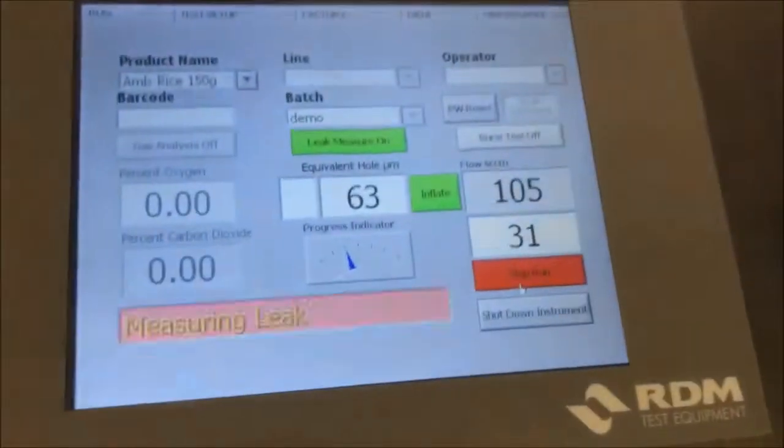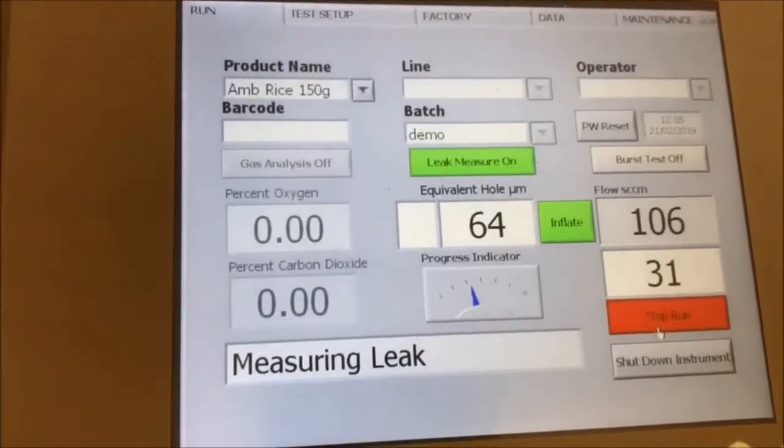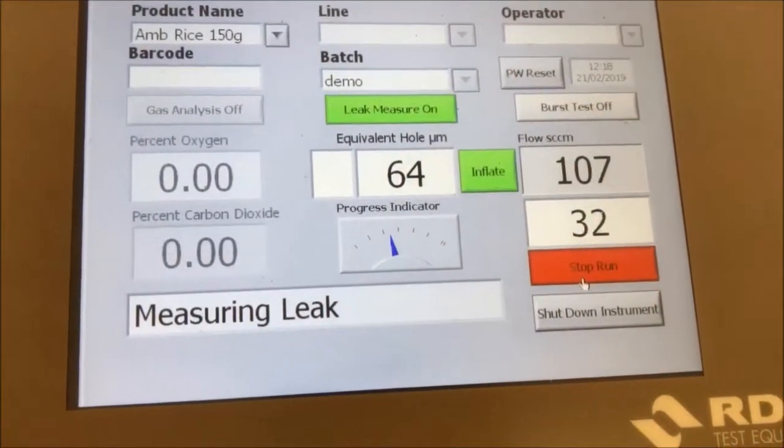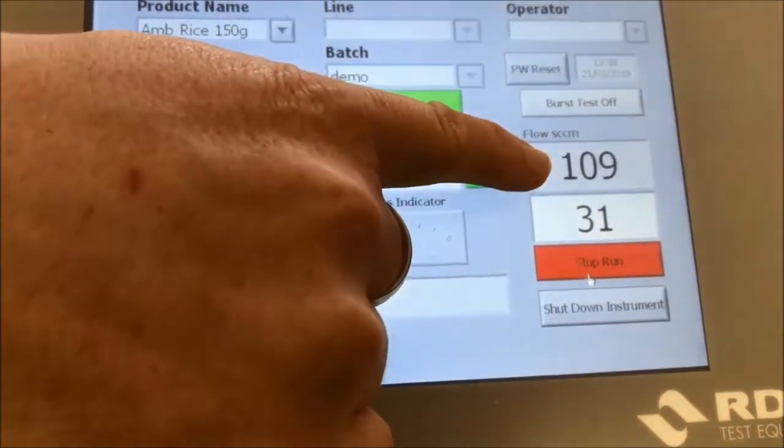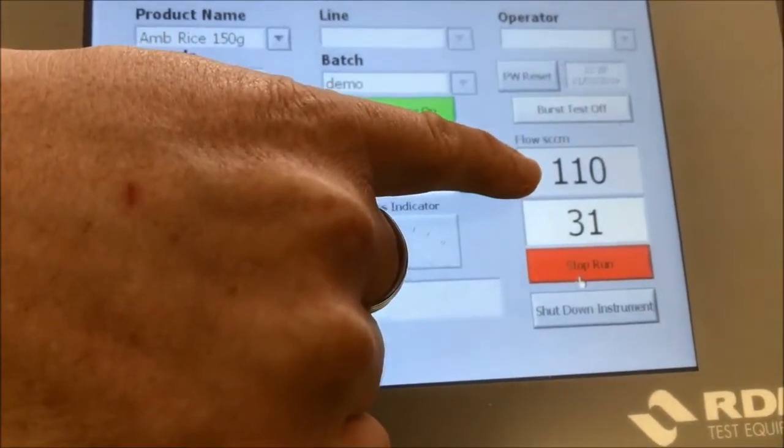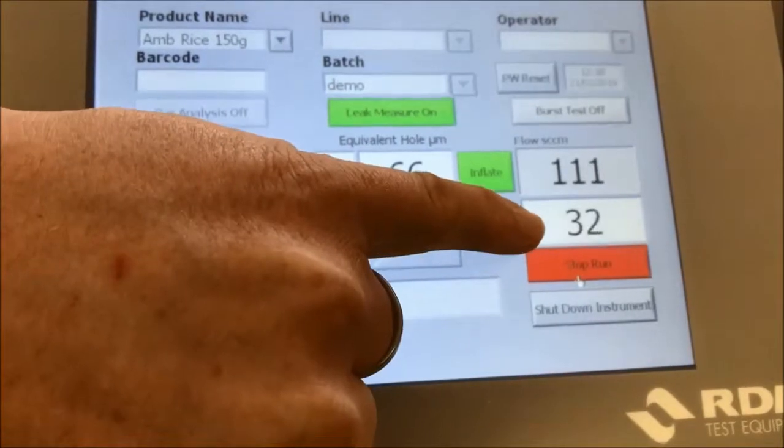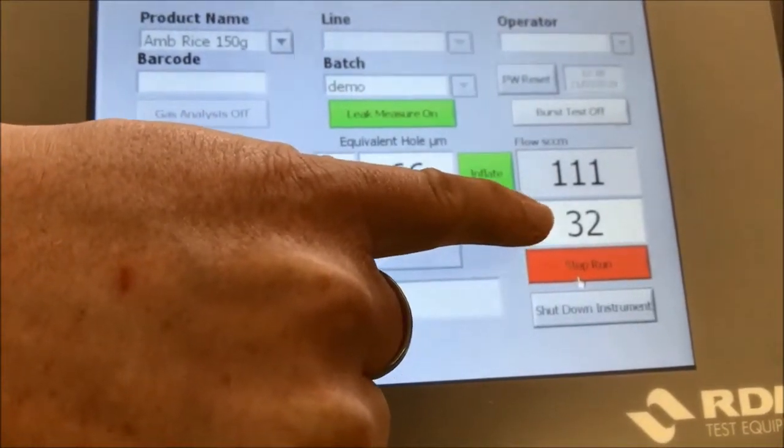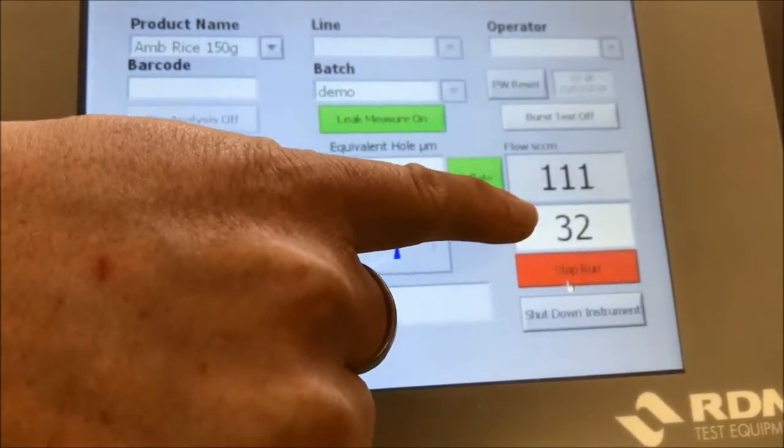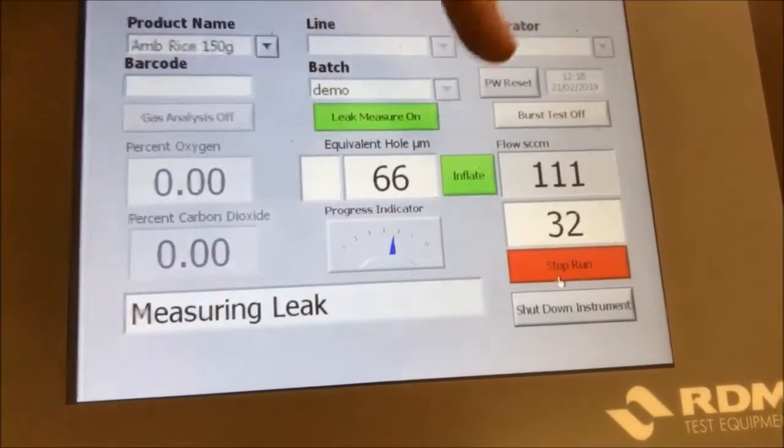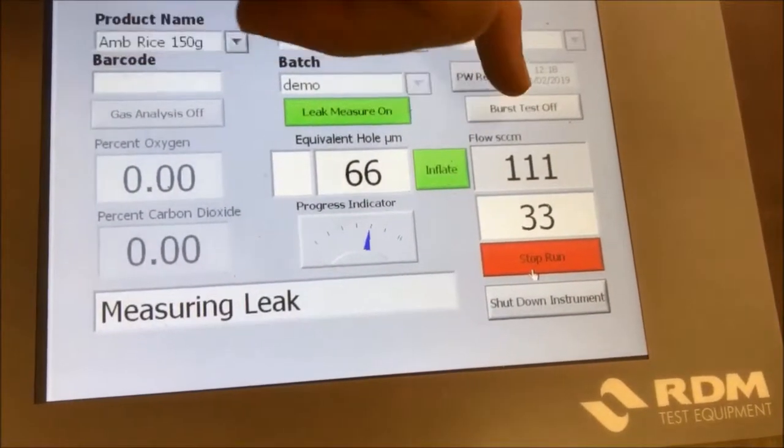Now on the instrument, let's have a look and see what's happening. What we're seeing now is a high airflow going into the pack to try and maintain 50 millibars. We can't get there—we can only get up to 30, 32 millibars. That's then resolving that flow into a hole size, and it's telling me around 66 microns is the hole size of that pack.